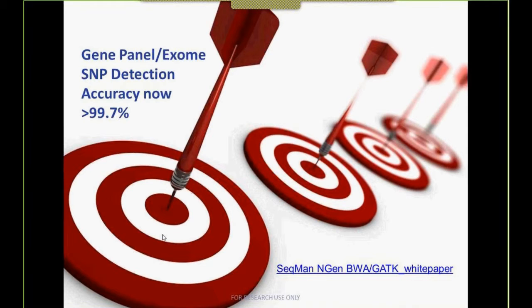And this is a human genome. You'll hear me refer to this again, but it's NA12878. It's the most sequenced human genome that's out there. Because of all the data from Illumina and Ion Torrent and 454 and Solid, the variants were verified, many of them through Sanger sequencing as well.